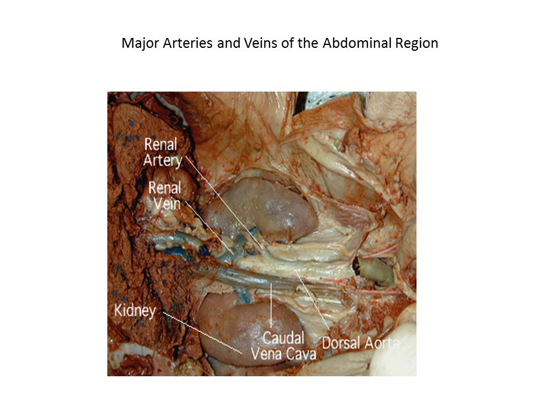Know now that they're a major filtering center, so we need lots of vasculature to pump all of our different blood through there to be filtered. That filtration is not only about detoxification, it's also about homeostasis. How watery are you? How salty are you? But make sure you can identify all the veins and all the arteries coming to and fro.